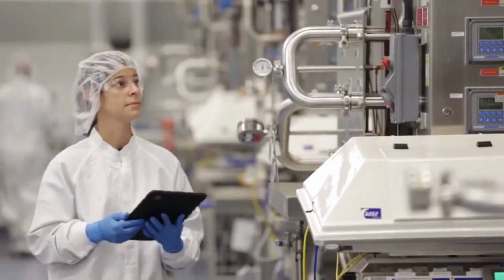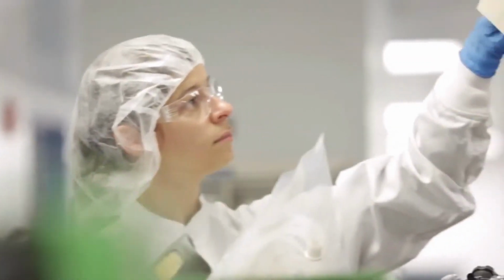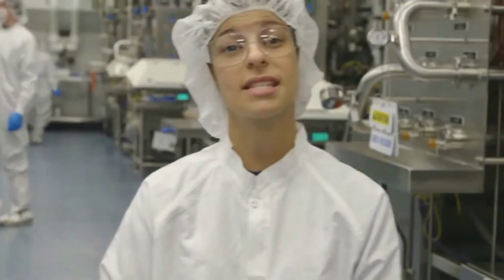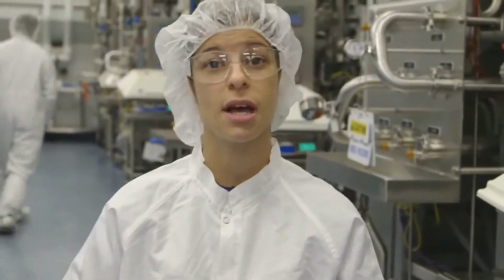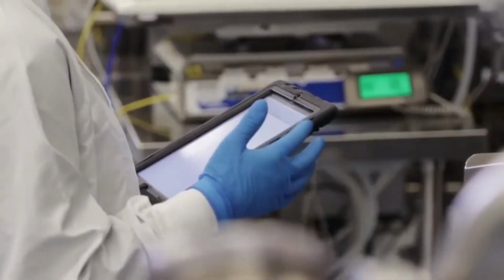I'm Michelle. I've been with Amgen for 13 years. I'm a frontline manager here in the cell culture area. The main purpose of the cell culture process is to scale up to higher and higher volumes, ultimately resulting in higher cell densities, which means when we transfer to the production bioreactor, we're able to produce protein.